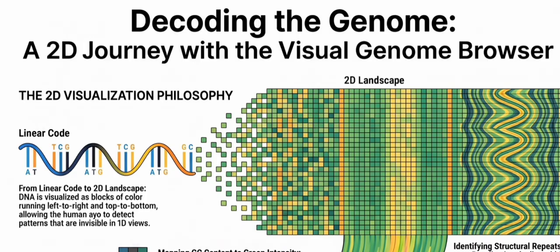Exactly. Instead, the sequencing software aligns the patient's data against the reference genome and only records the exact points where the patient's code diverges from the standard map. It only records the typos. Exactly. Every single divergent base is logged in a highly specific standardized file called a variant calling format, or a VCF file. This file acts as a catalog of mutations. It lists the SNPs, single nucleotide polymorphisms, which are simple one-letter typos where a C is swapped for a T. It also lists the INDELs, insertions and deletions, where chunks of code have been erroneously added or completely deleted.